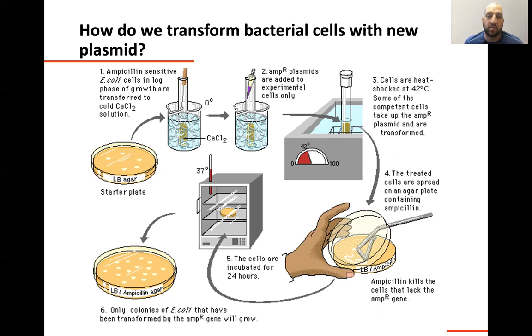with those membranes. So then when we move the cells over to 42 degrees, we're heating them, raising the temperature from ice cold to 42 degrees, which is above body temperature. We're heating them up so much that what should be happening is the membrane should be moving, oscillating, bouncing around. The cell should be expanding as part of this as well. And so we're hoping that in that expansion and the movement of the membrane, the cells are taking up plasmid.